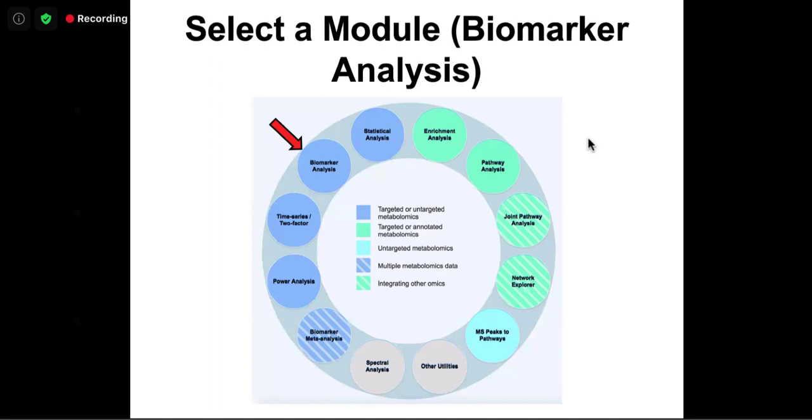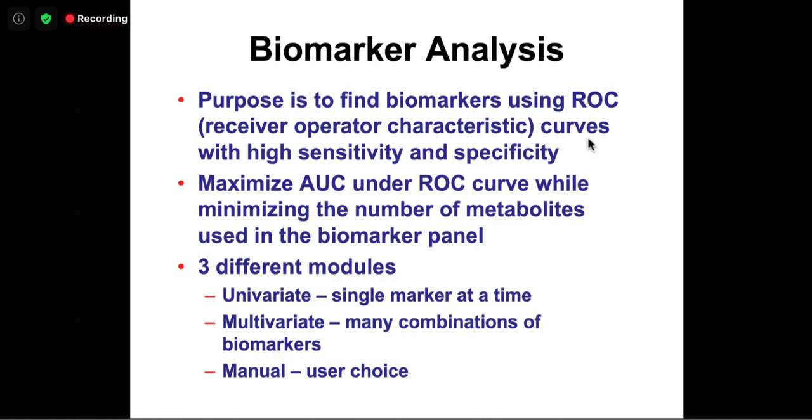So let's keep going. We were talking this morning about classification. We see the accuracy and error rate, which is fine, but it's not biomarker analysis. Biomarker analysis is actually quite different. It is talking about sensitivity, specificity, and ROC AUC. That's more meaningful in clinical settings. That's why at the beginning I asked, why don't people use some machine learning methods? And we realized that it's not that straightforward.